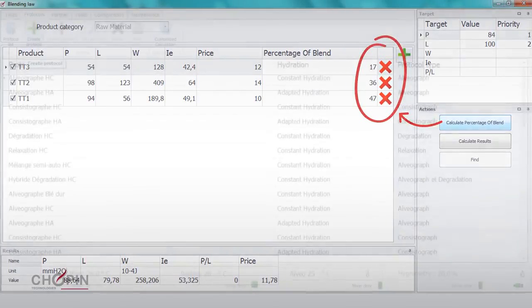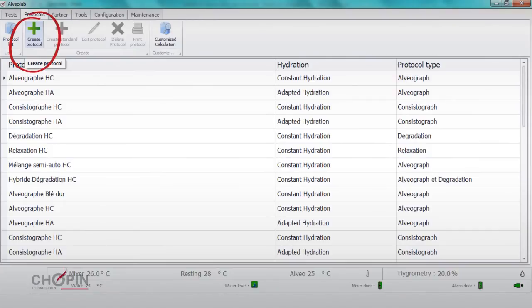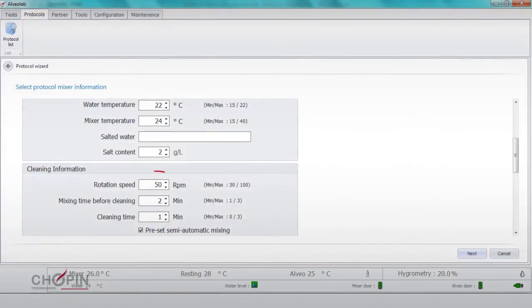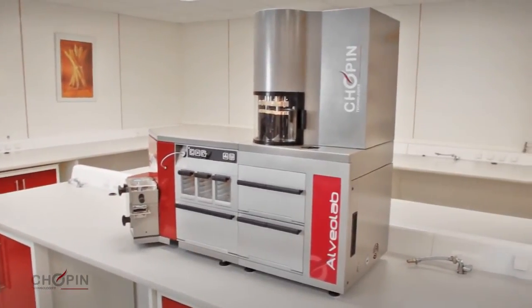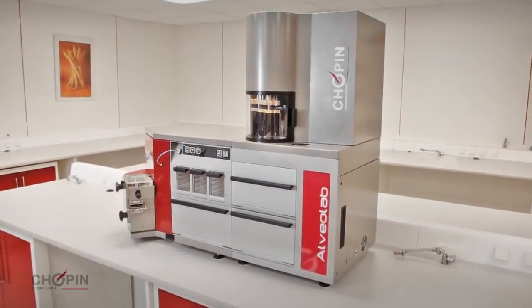Additionally, customized testing protocols can be developed by varying, for example, the intensity and duration of mixing. Using the Alveolab, it's now possible to increase the number of tests carried out daily, thus optimizing the return on investment.